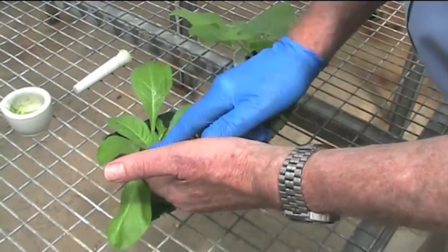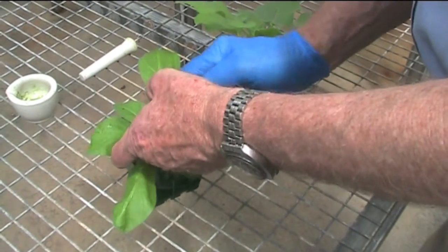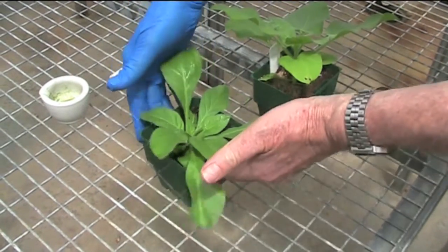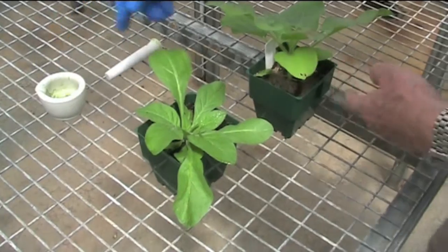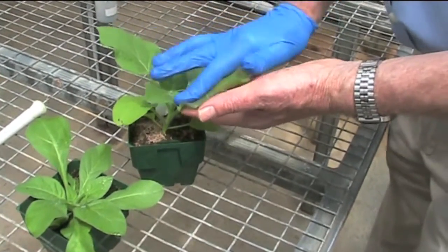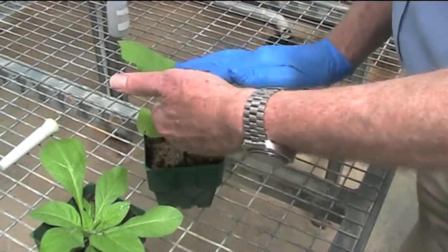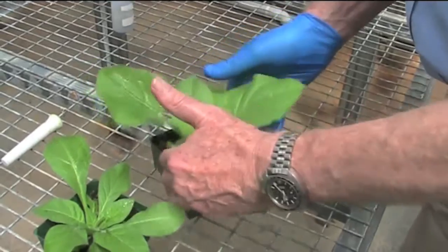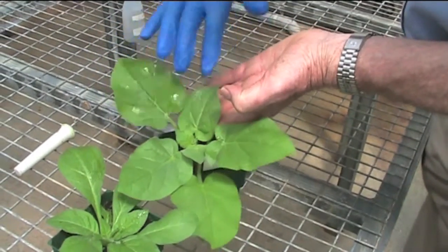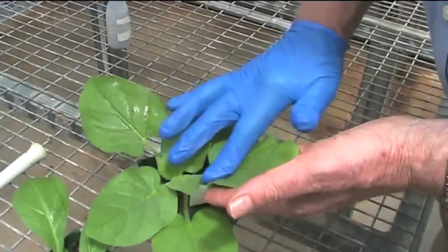We inoculate up to three expanded leaves. This is Nicotiana clevelandii. This is Nicotiana glutinosa. We apply inoculum to whichever plants we want to inoculate. So all we have is just a light coating of liquid inoculum on the leaf, and that rapidly dries off.